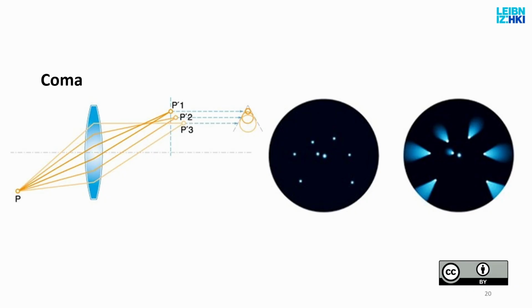And this means that objects which are optimally little spheres or circles will turn into shapes which look like a comet in the sky. It has a core, and then it has a cone-shaped part like a skirt, except for those which are smack in the middle of the lens.